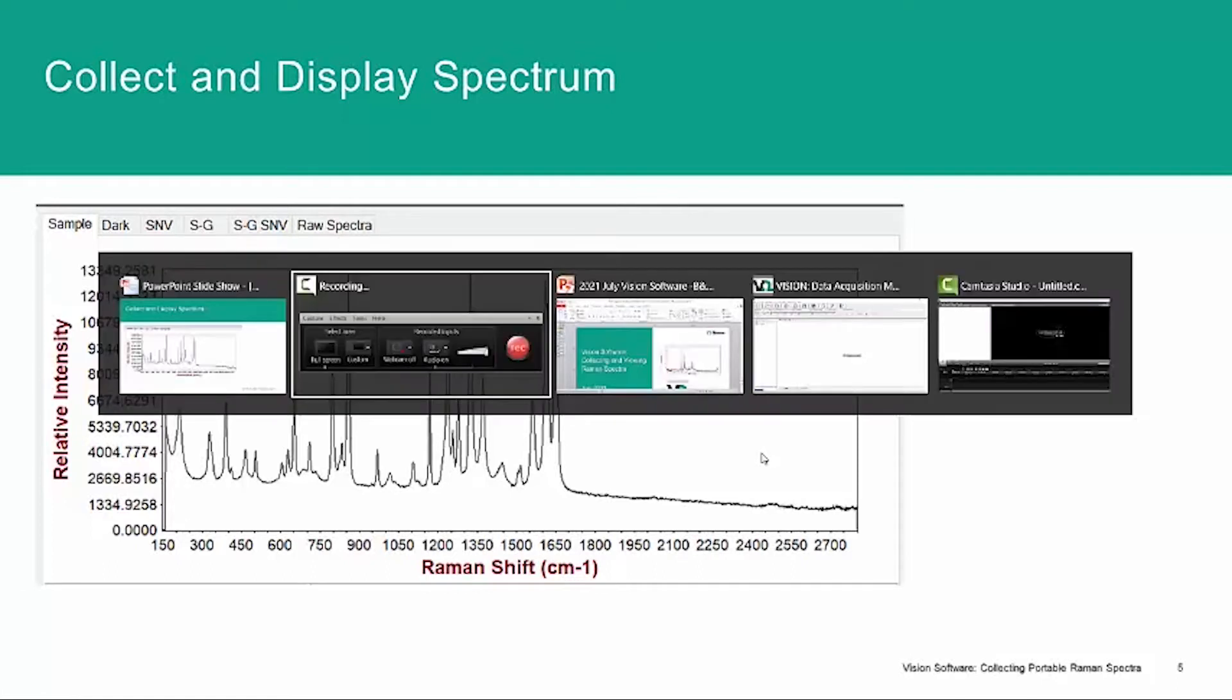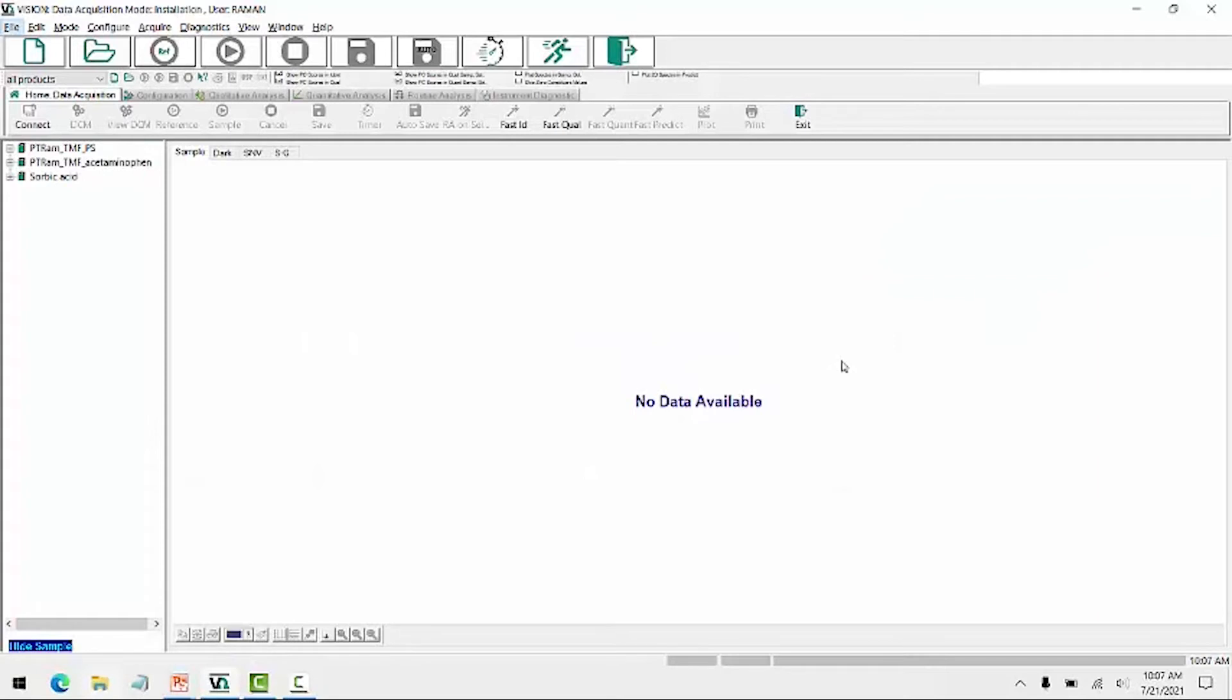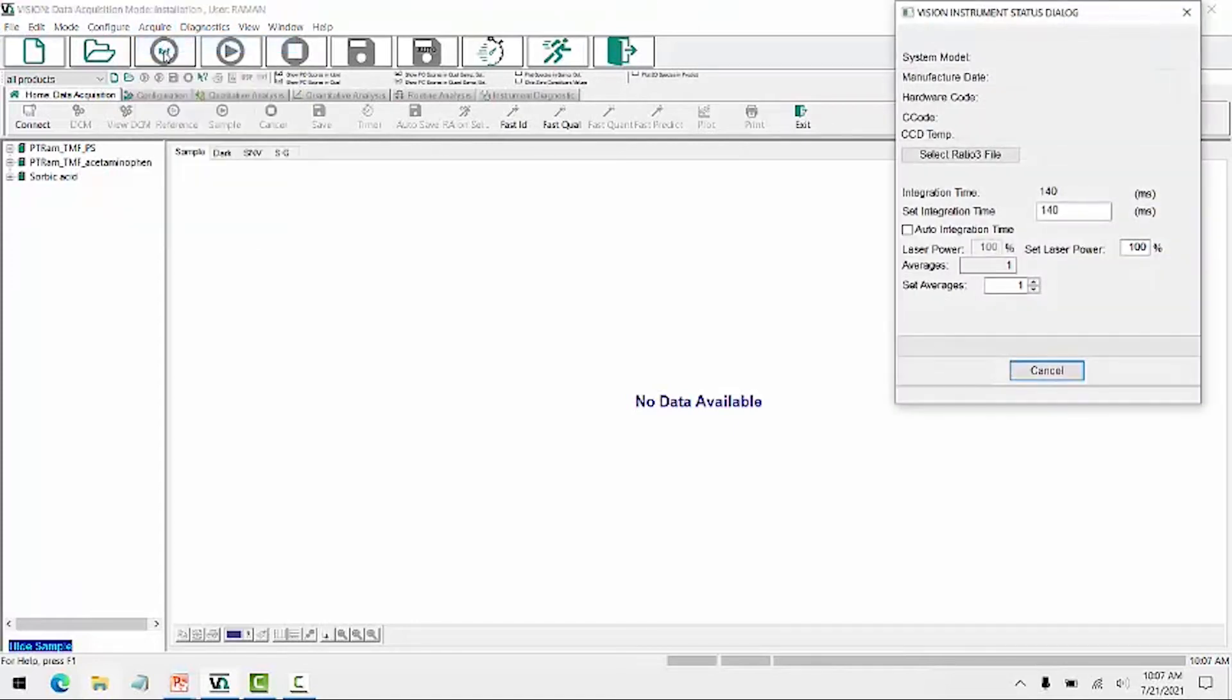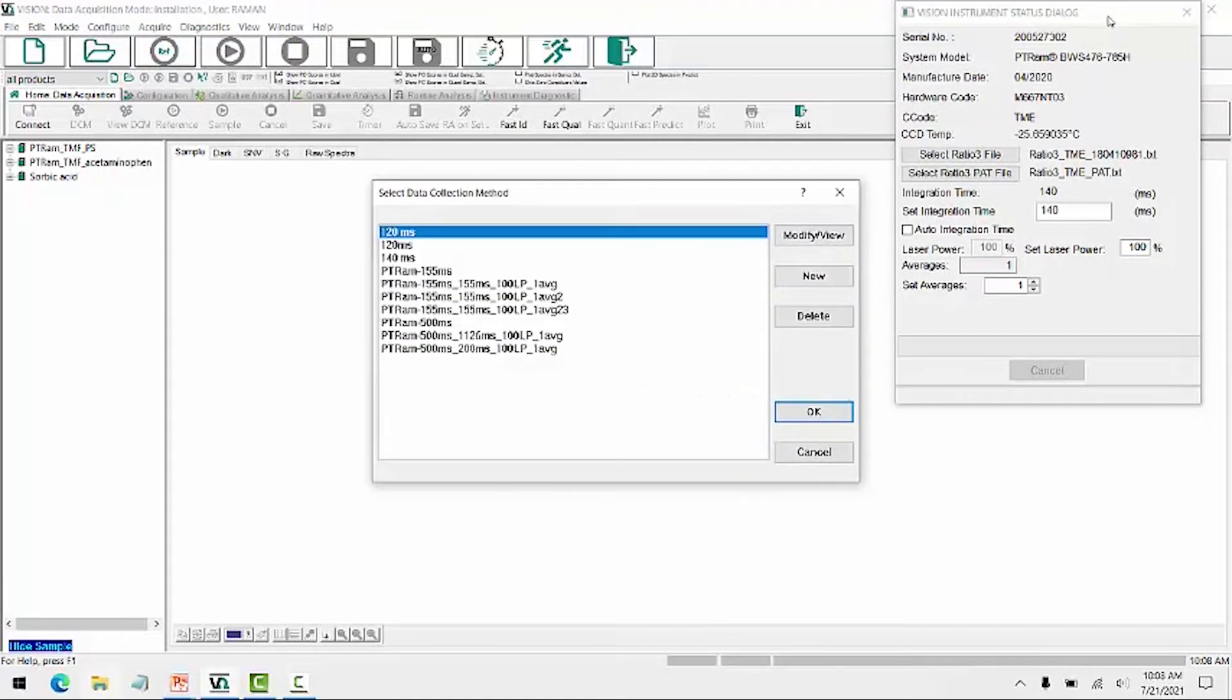Now let's turn over to the vision software and collect some spectra. So here I'm at the vision interface, and I want to connect to my instrument. You go to acquire, connect.